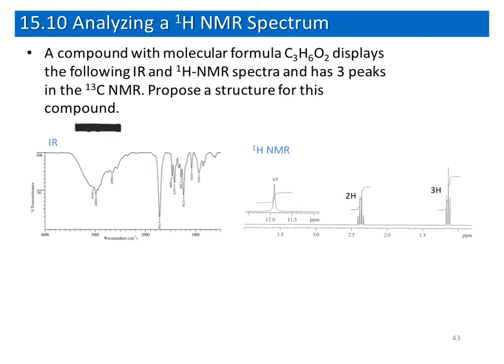Now, before working on this question, something about hydrogen NMR I would like to mention is that this subsection here at around 12 ppm is part of the spectrum.